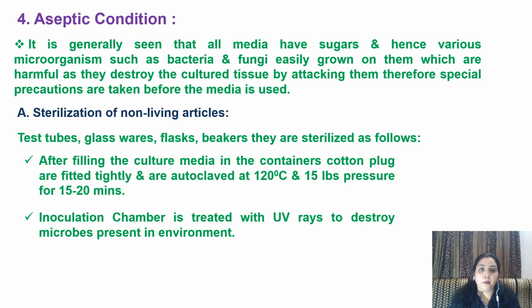Aseptic condition. It is generally seen that all the media have sugars, hence there is a probability of growth of microorganisms on them, which are harmful as they destroy the culture tissue by attacking them. Therefore, special precautions are taken before the media is used. For this, sterilization of living and non-living articles is done.